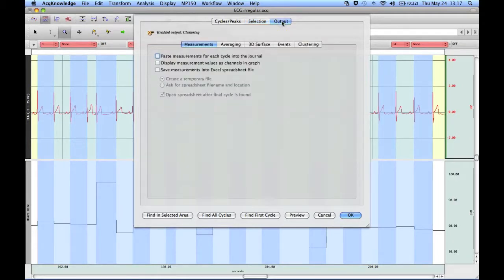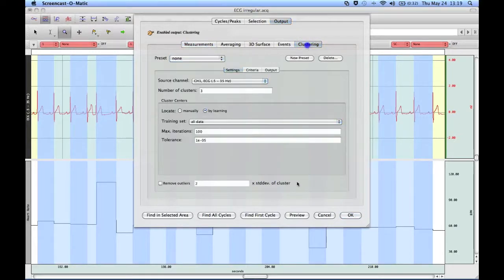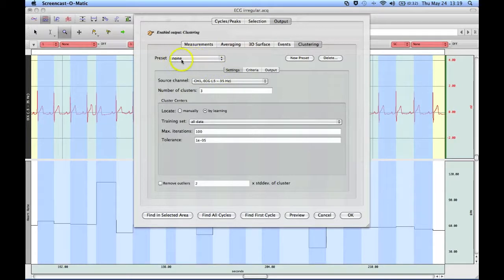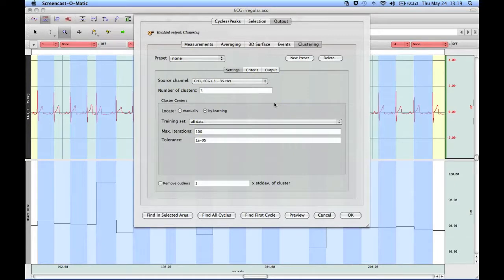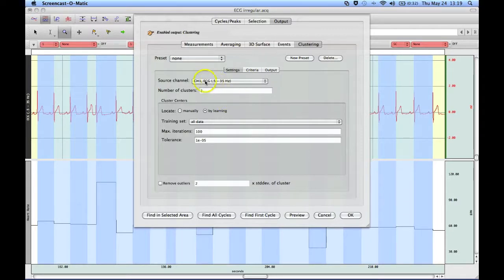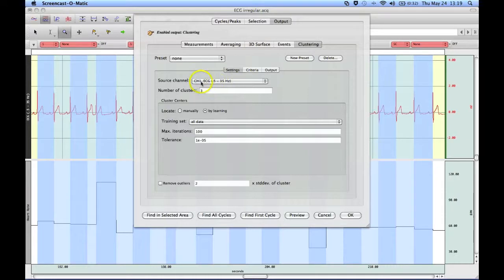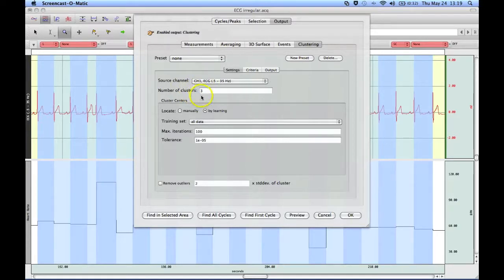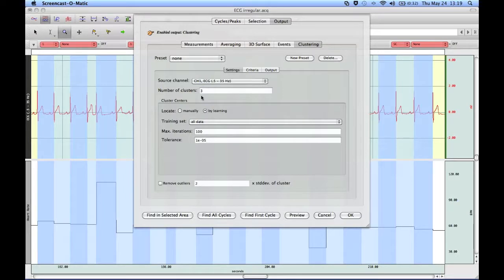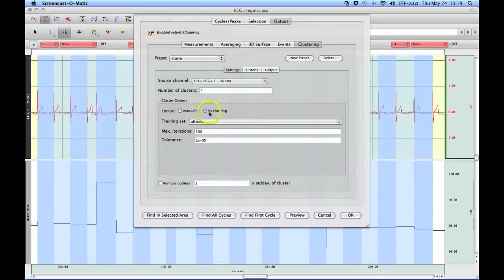Then under the Output tab, there's the clustering option. The clustering section allows you to create a series of presets, so once you've defined your criteria and have everything set up, you can create a new preset, and then you never have to worry about that again. The software needs to know which source channel you're going to use. So again, we're using channel one. It's asking us for the number of clusters. As I mentioned previously, I'm going to use three clusters for this, three different groups. And I'm going to let the software identify the cluster centers by learning, and it usually does a pretty good job.